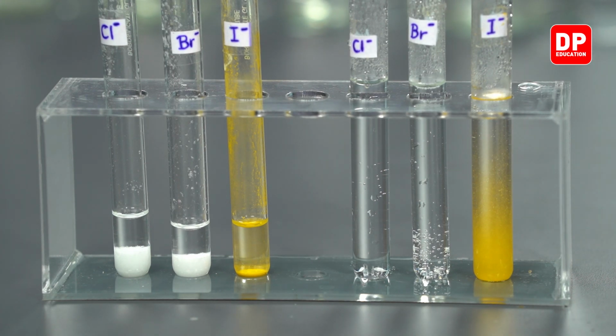Students, you can see here when it comes to the lead iodide hot solution, as it cools down, it starts to form lead iodide precipitate again. Earlier on, it was a clear lead iodide solution formed by dissolving the lead iodide in hot water.